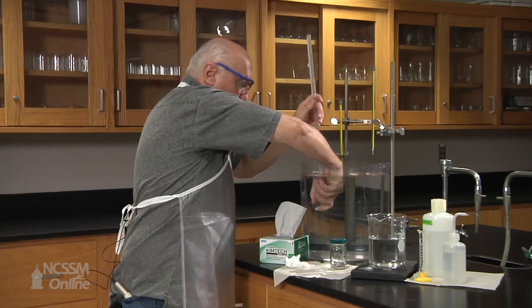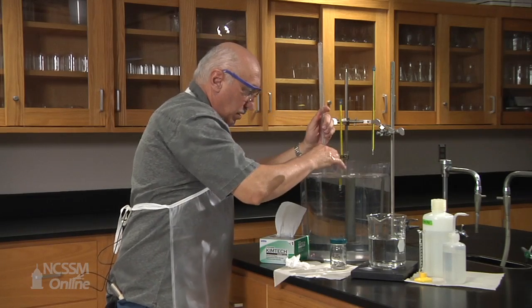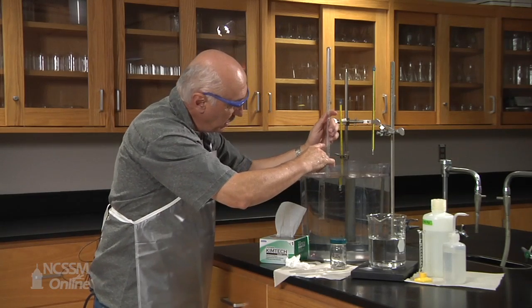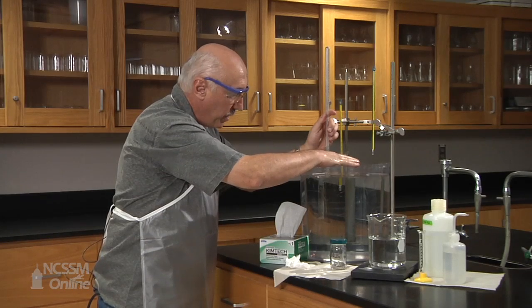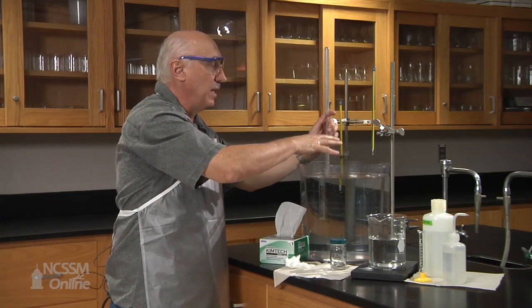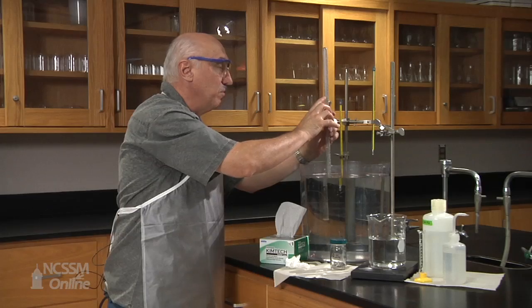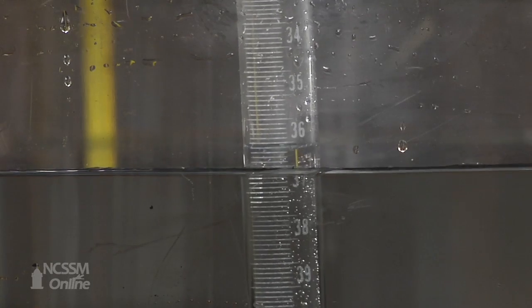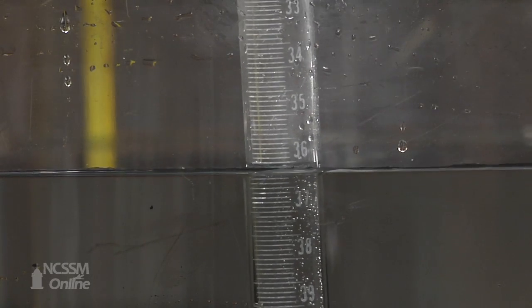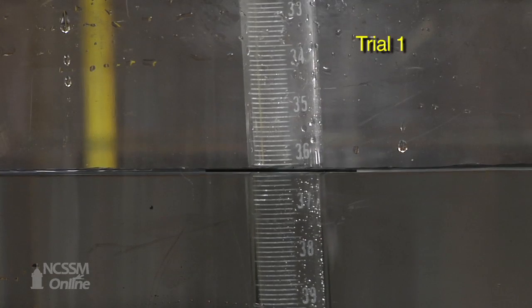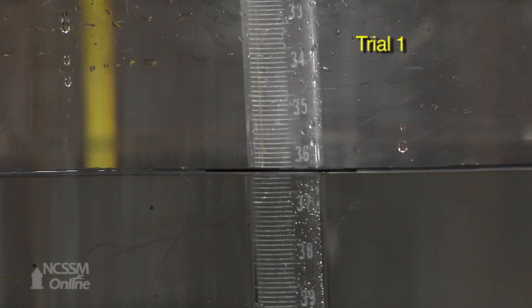And we're going to adjust the meniscus in the tube with the level of water here so that we ensure that the atmospheric pressure inside the test tube matches the atmospheric pressure outside. And now the two liquids are at the same level.